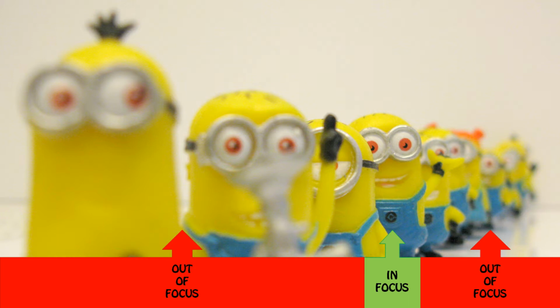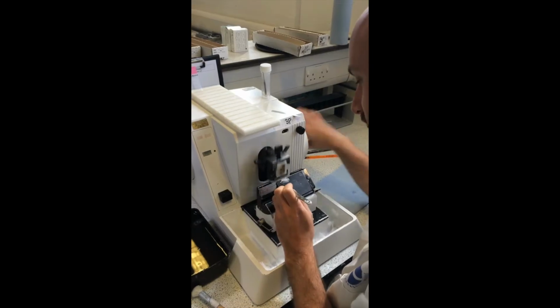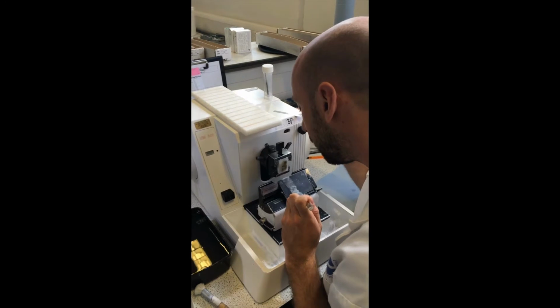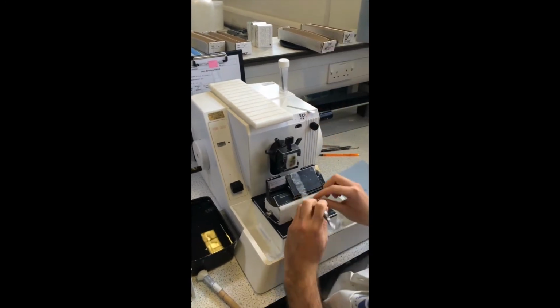This is why, when we look at samples on a conventional microscope, we try to make those samples as thin and flat as possible, often by embedding them in wax and then cutting very thin slices, about 5/1000 of a millimetre thick.